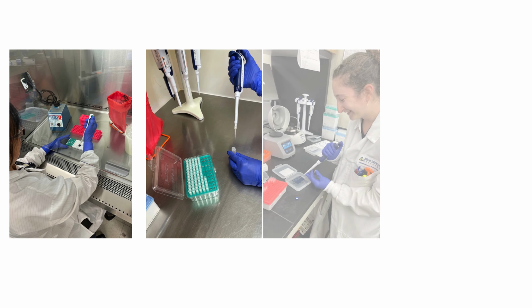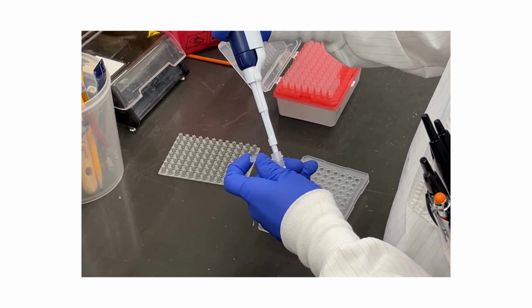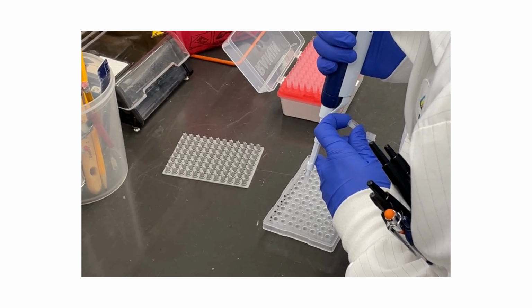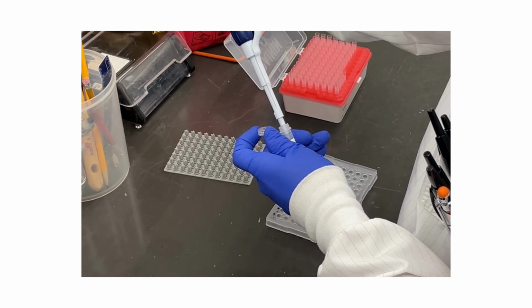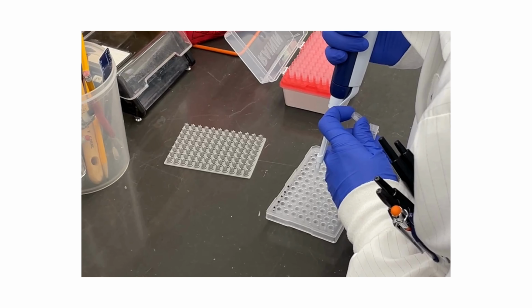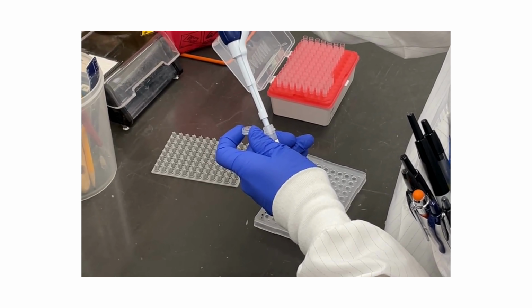Pipetting is an integral part of performing many microbiology tests, especially for molecular testing. The volumes pipetted can be very small, so a micropipette is often used. Micropipettes are used to pipette volumes less than 1 milliliter and can go as low as a tenth of a microliter. The smaller the volume, the more important and difficult it is to accurately pipette.